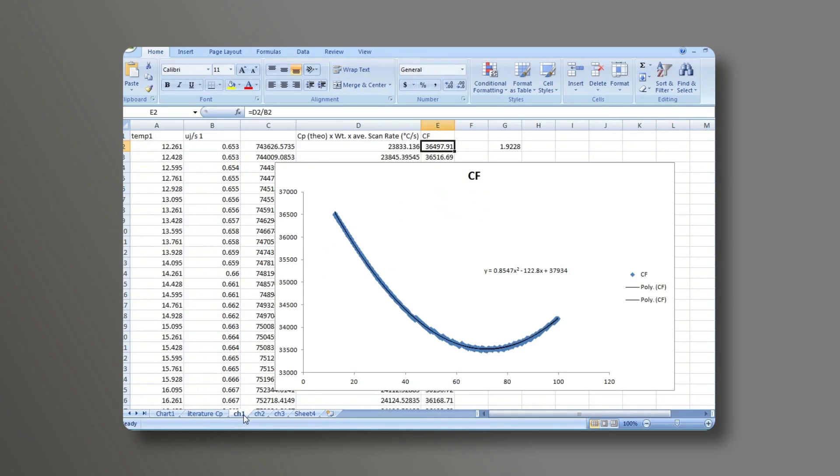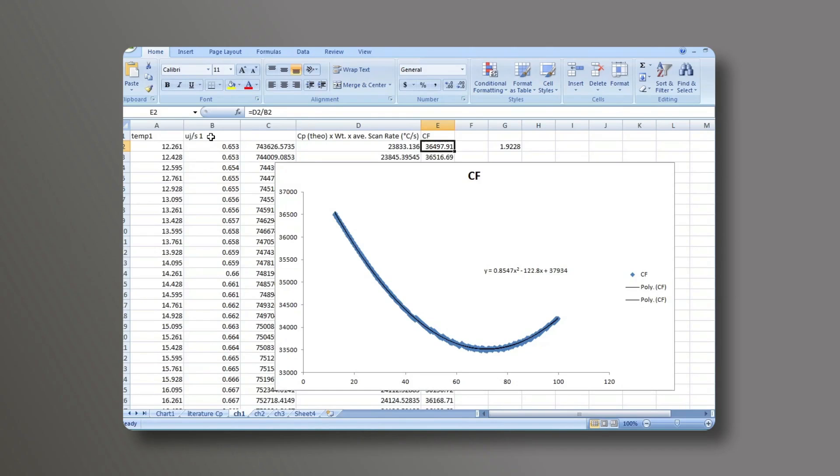Now the experimental data for the SAFIRE that was run in the MCDSC can be processed. In the first column is the temperature and in the second column is the wattage, in this case with the units of microjoules per second. Both of these have been copied and exported from the MCDSC run analysis software nanoanalyze.